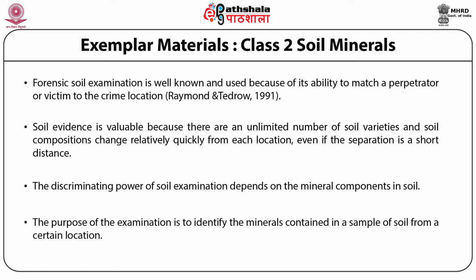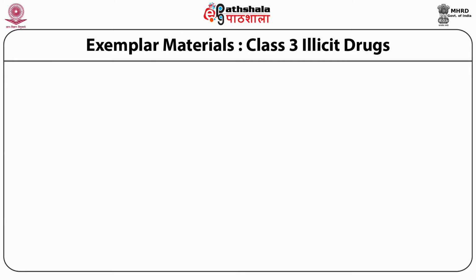The purpose of the examination is to identify the minerals contained in a sample of soil from a certain location. Class 3 is the illicit drugs.